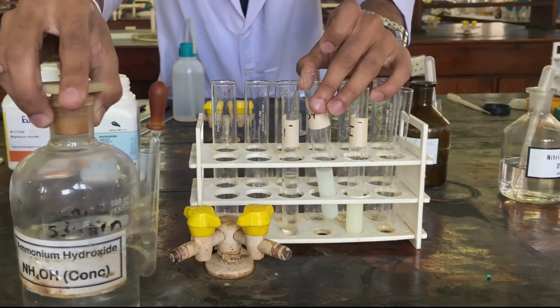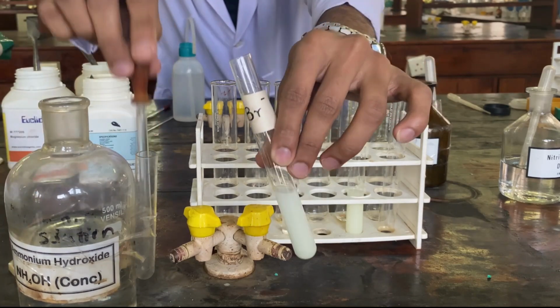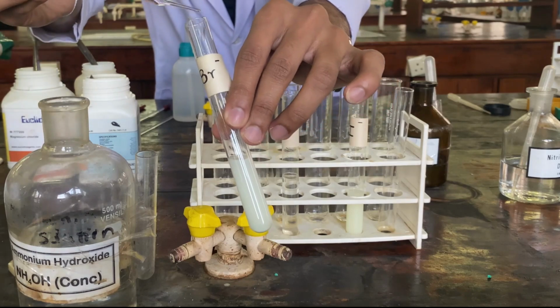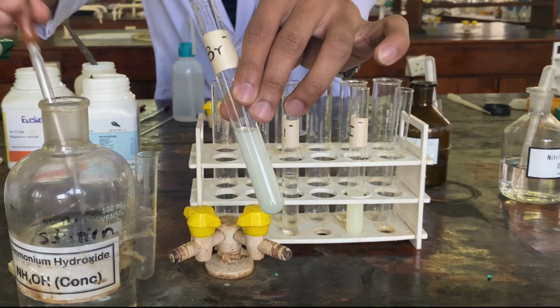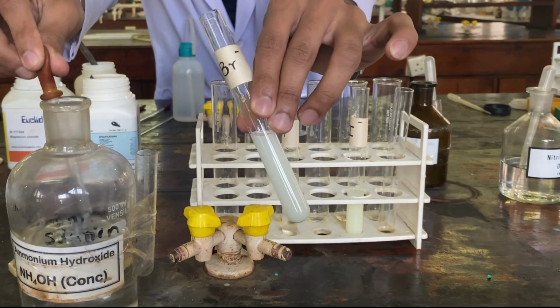Then take the second test tube. Add concentrated ammonium hydroxide into the second test tube which contains silver bromide precipitate, and let's check whether the precipitate dissolves.